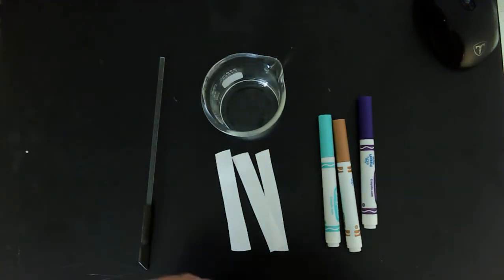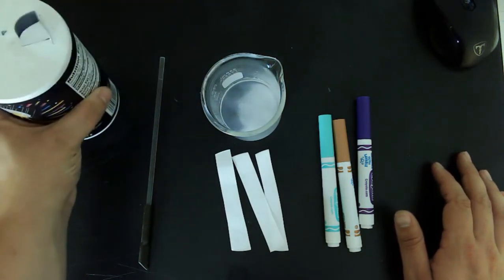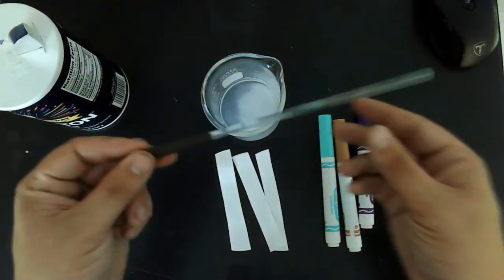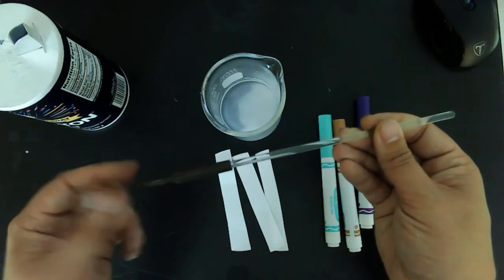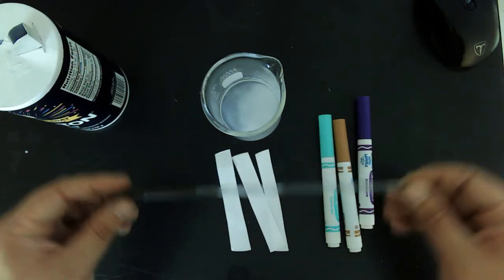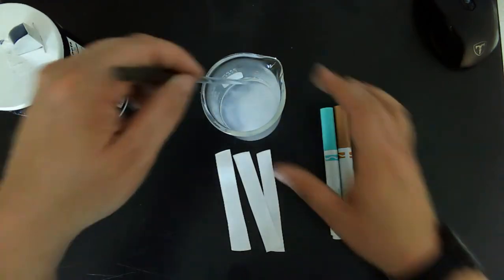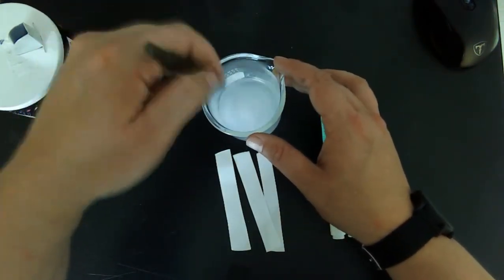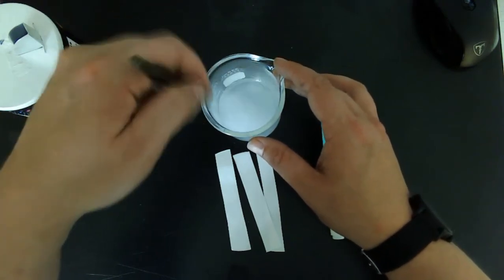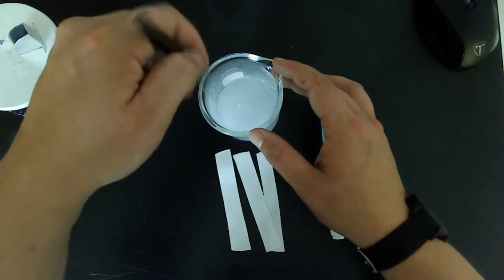The first thing I'm going to do is I already have my chromatography strips cut out. Now we're going to make our salt water solution. We're going to use just about a spoonful of salt in some water, mixing with our glass stir rod. These little rubber boots, we're not going to mix with this part; we're going to mix with the glass rod. The rubber boot keeps it from spinning when it's on the table, so it doesn't roll off and hit the ground and break on me. Okay, we'll mix this together. It is totally fine that there are crystals at the bottom. We're just making a super saturated solution of salt water.